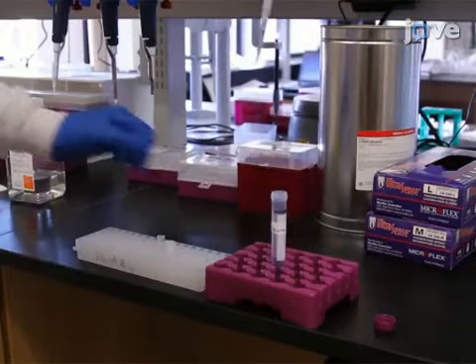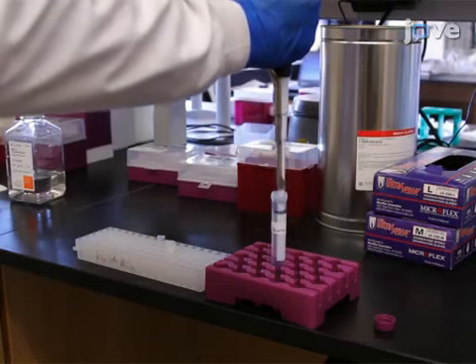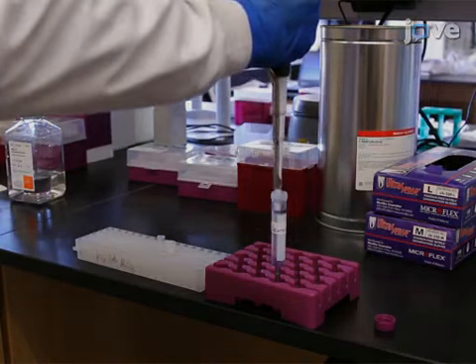With all the solutions prepared, mix equal volumes of gelatin solution and the P-NiPAM copolymer containing magnetic nanoparticles, and vortex the mixture thoroughly.